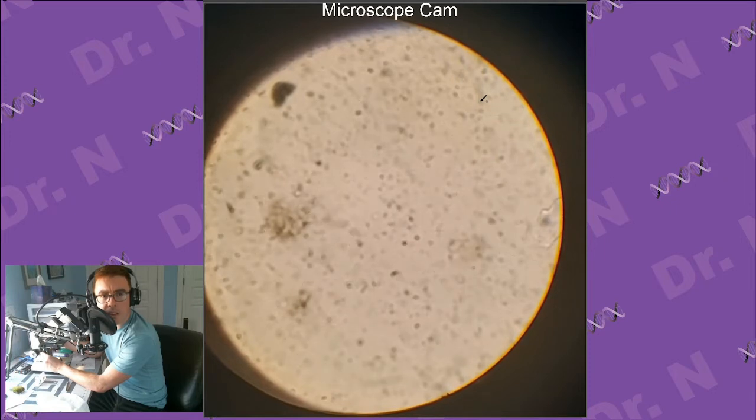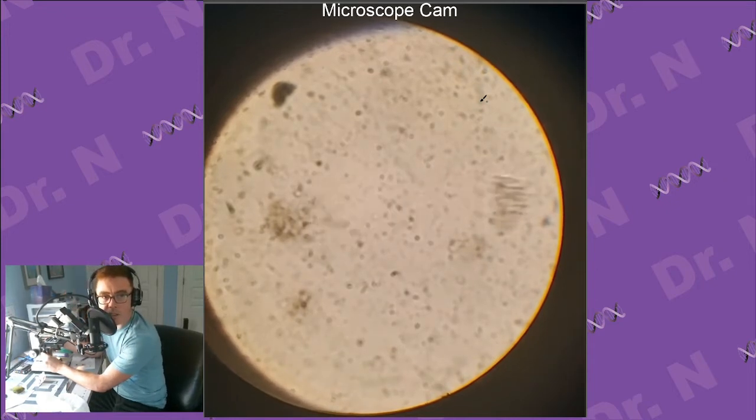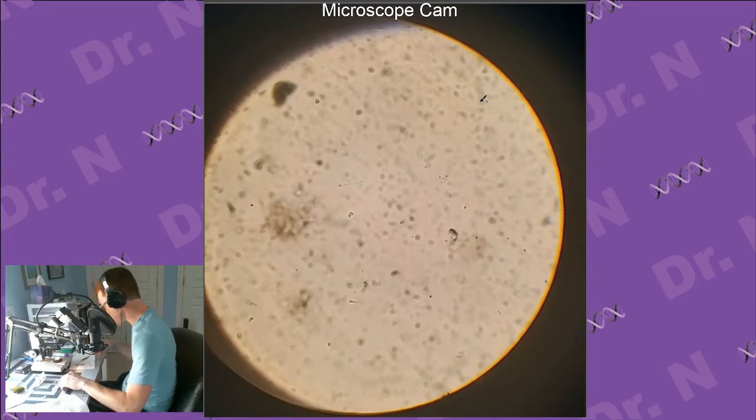All right, there was a piece of moss on here that looked like it had a lot more structure to it. So I might just take a bit of that and squish it down. We can look at some moss cells, and maybe there will be something that was hanging out on the moss too. Tardigrades are supposed to be everywhere, and yet I've never been able to find one. Not that I've looked too hard. What's this? Maybe that's just trash. Okay, I'm going to grab another sample.